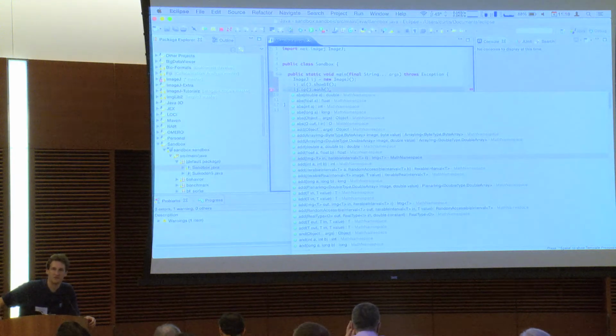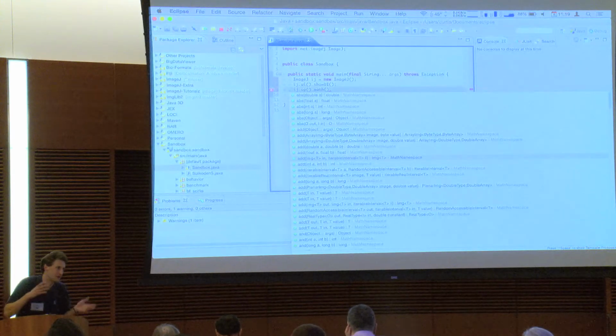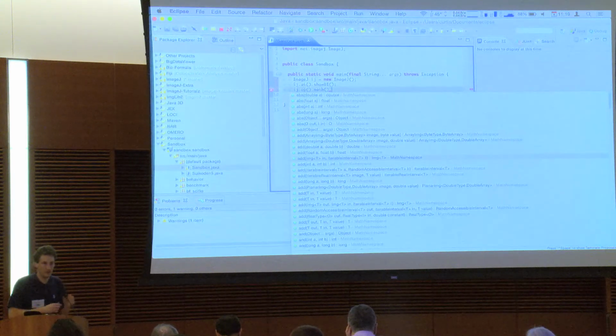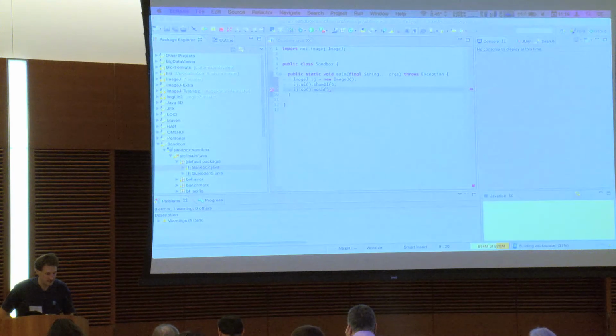Yeah, exactly. In theory, that's working now, actually, because we did upload that. I didn't test it, so I'm not going to even try right now. But it should work. Control space is the autocomplete key. And it works because, if you think about it, this is really complex. Whatever editor you're using needs to, on the fly, create what's called an abstract syntax tree, but it's sort of like partly compiling your code. It's parsing it out and figuring out what actually is the semantic meaning of this variable and what kind of type it is. So it's not an easy problem, but people have worked a lot on it.